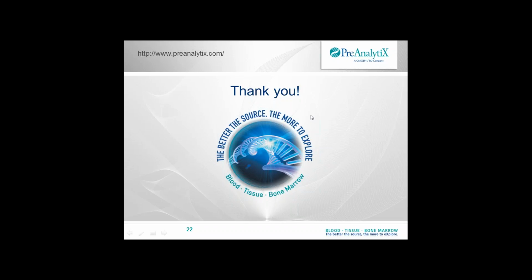Okay, thank you, Thorsten. The next question is actually a bit specific on the kit. I will read it out. Maybe you can answer, or maybe we can reply back. So, what exactly is the difference between the circulating nucleic acid kit? I think they're talking about the QIAamp versus the PAXgene blood ccfDNA kit. If both can be used with the blood collected in PAXgene blood ccfDNA tubes.